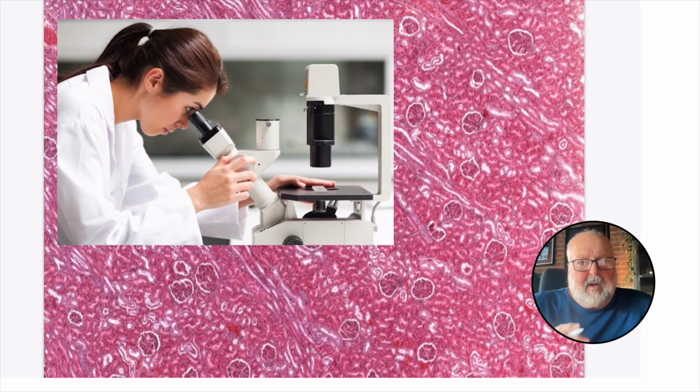In this video, we're going to have a look at histology. Now, histology drives many students crazy because when you look down the microscope, it just looks like a hot mess. So let's take a few minutes to define what histology is, talk a little bit about how we prepare the slides, because that's really important for understanding what we're going to see. And then let's look at epithelial tissue.